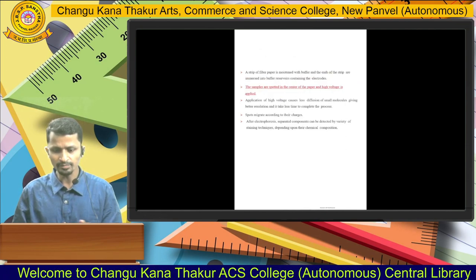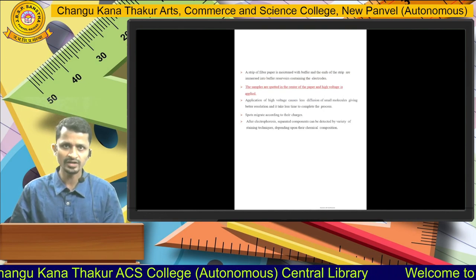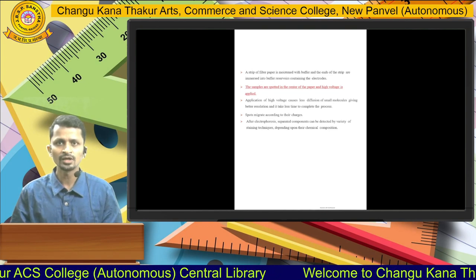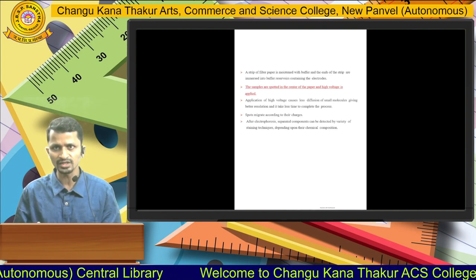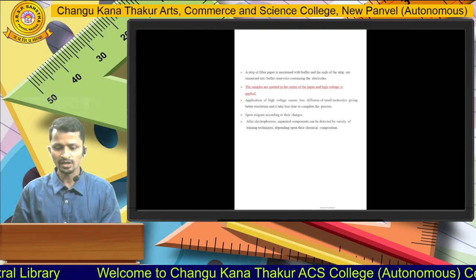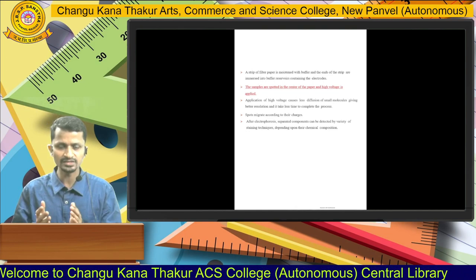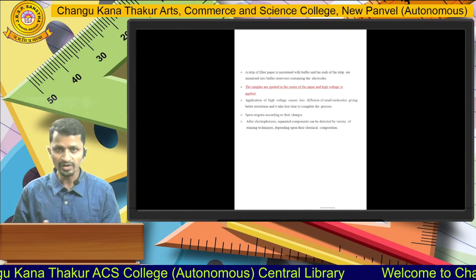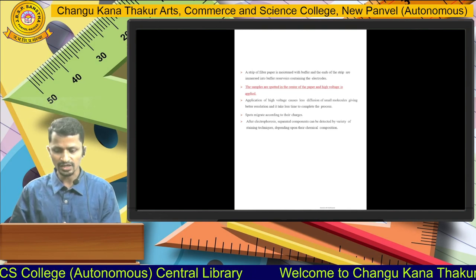So here in the paper electrophoresis technique, the paper strip is moistened or wetted with the buffer solution, and then it is kept in the buffer solution. The paper strip is fixed at both ends, and then the sample material is spotted at the middle of the paper strip. And when the electricity is supplied, the movement of the charged particles starts toward the electrode of opposite charge.